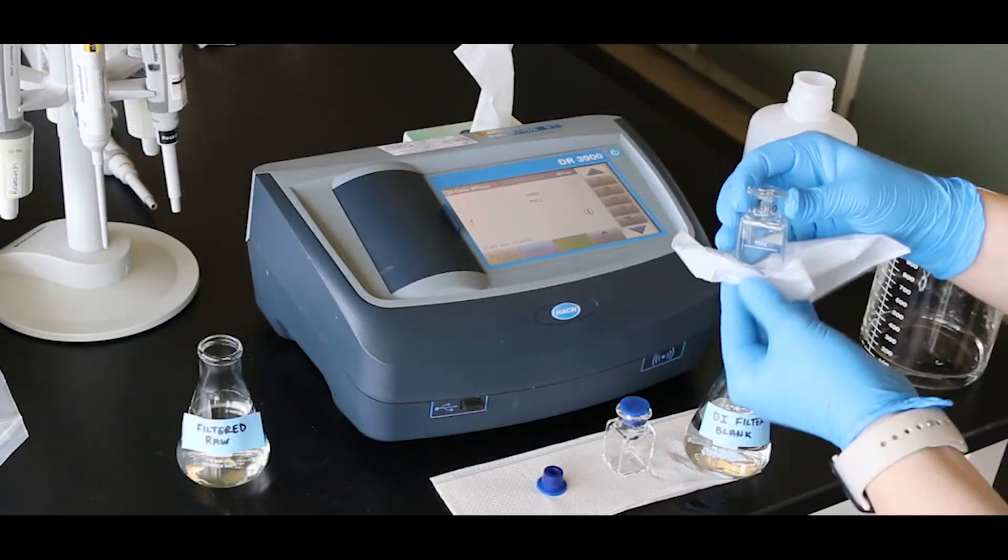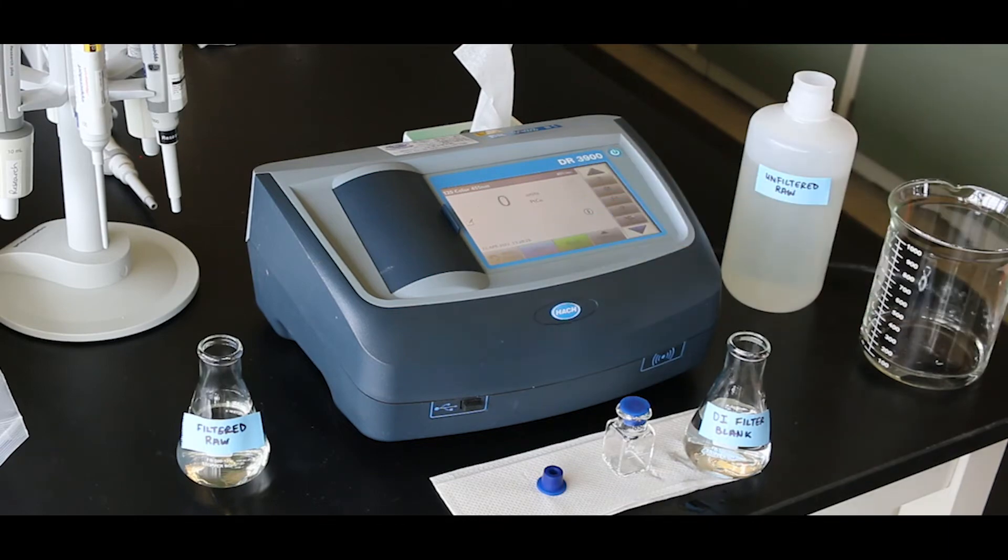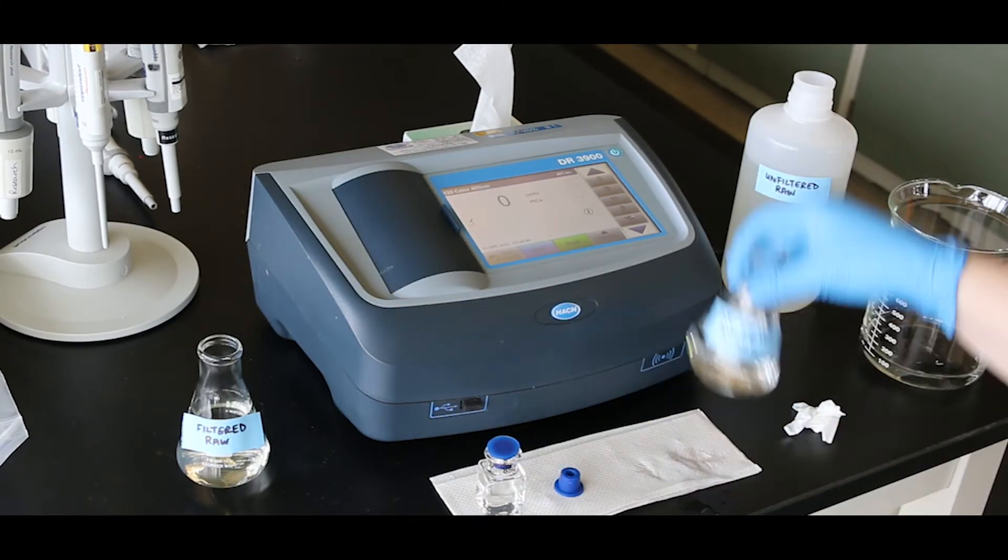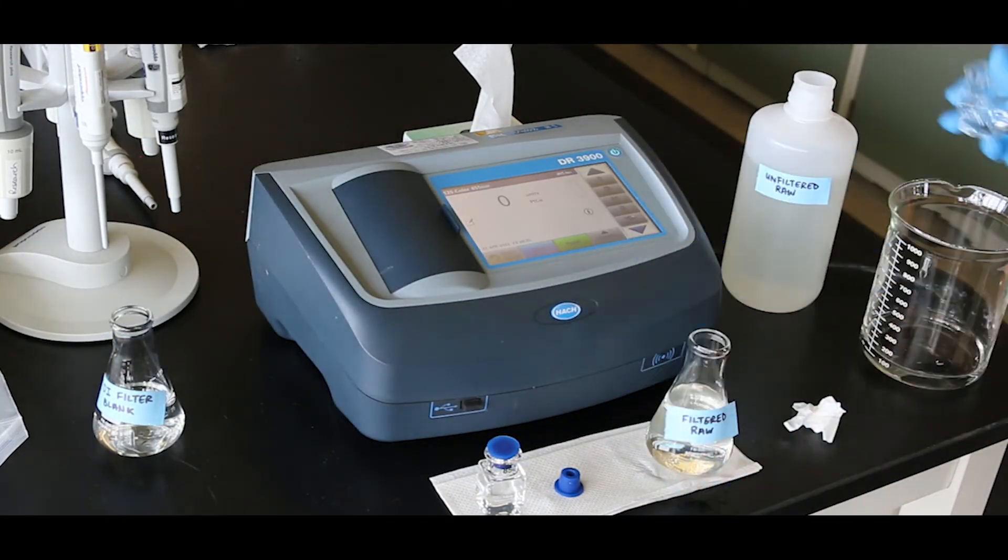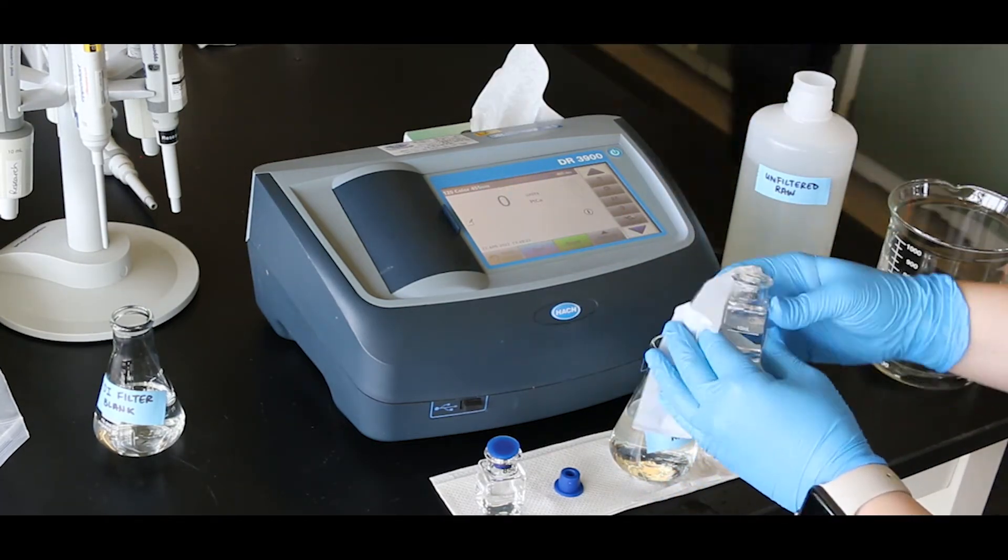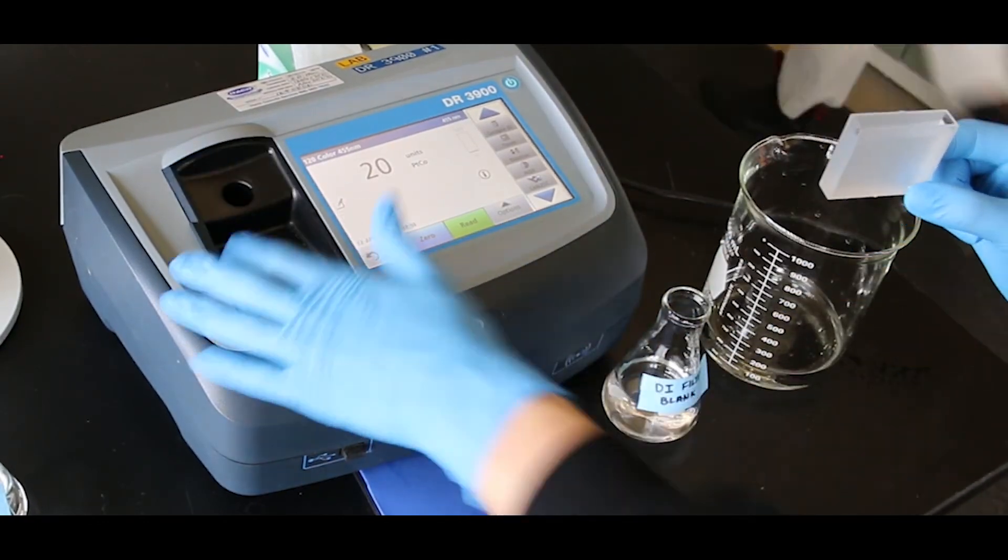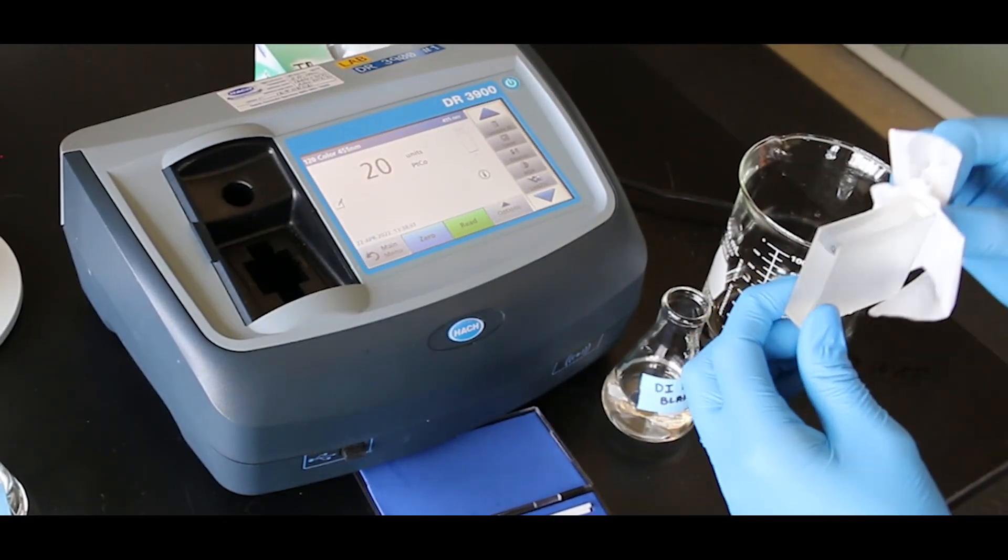For low-range color, under 15 platinum-cobalt units, use the same cell to zero the blank and read the prepared sample. Make sure the cell is rinsed well and conditioned with the sample. For very low levels, a rectangular cell with a longer path length can also be used. See method for details.